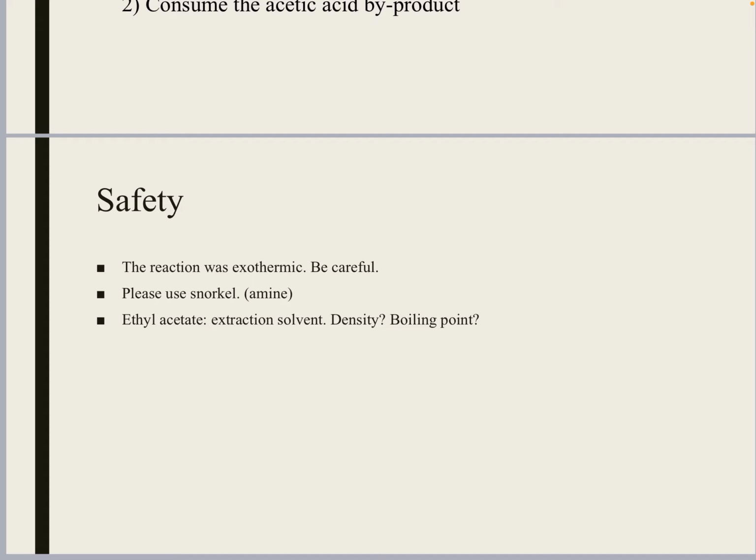You're going to see the product being formed at the bottom of the beaker when the temperature cools down. If it still remains in the liquid form, then you know you still have some ethyl acetate. Make sure to put that back on and get rid of all the solvent. Does that make sense? You're going to know what I'm referring to when you're running the reaction yourself, right? Because sometimes students will be asking, I've been boiling off my solvent for an hour. How come I still have only liquid? That's because your product melted on the hot plate. You may have to let the temperature cool down for the solid to be formed.